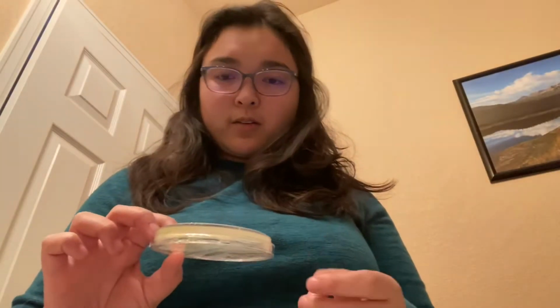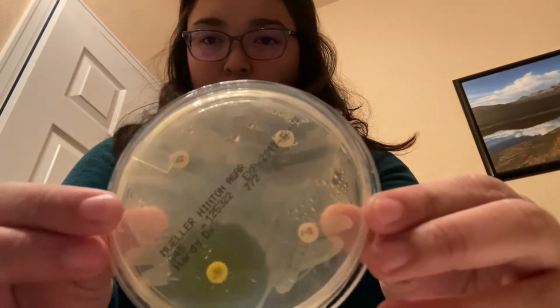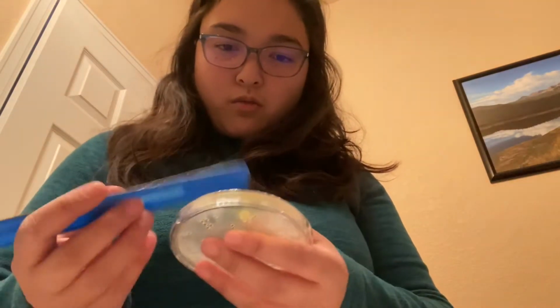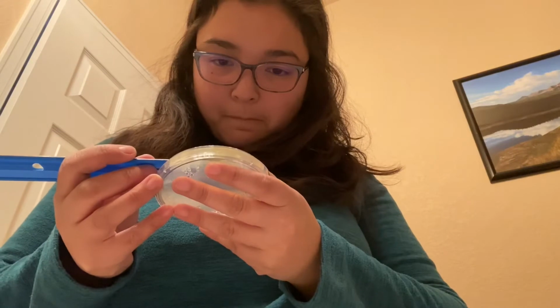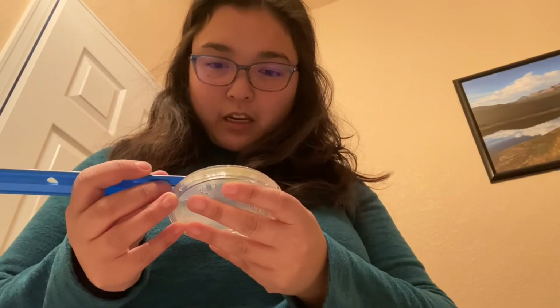All right, so it's been about 17 hours since I put my Mueller-Hinton plate in the incubator. As you can see, these 3 had some reactions, so I'm going to measure them. This first one, which is a little bit yellow, is the nitrofurantoin one. Measuring it, it looks like it's about 30 millimeters. So I'm going to write that down. According to my chart, if it is bigger than that, it is susceptible to that one.